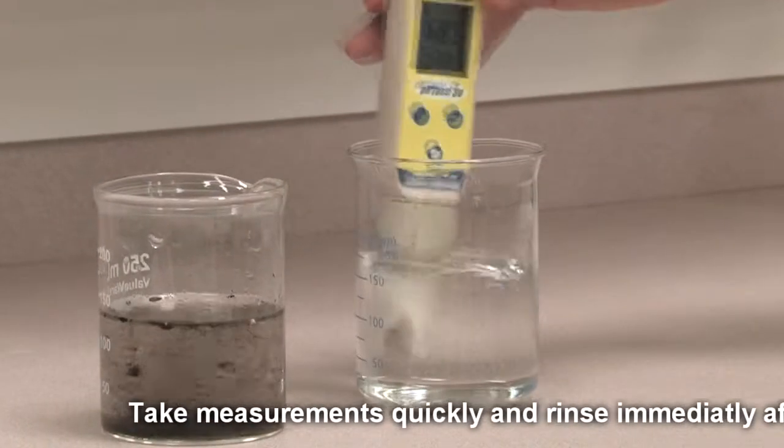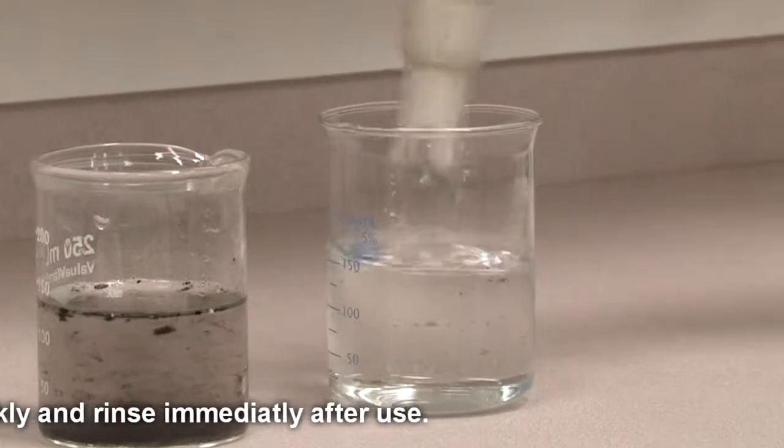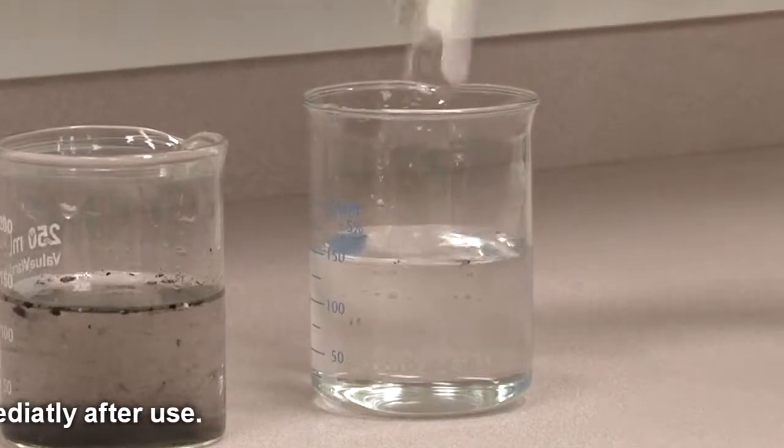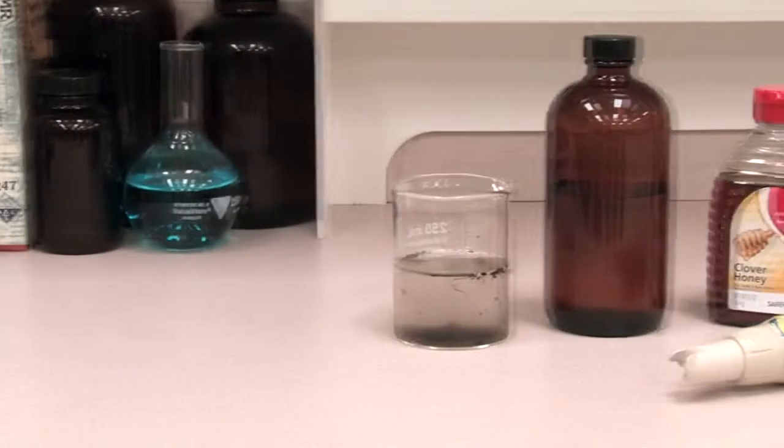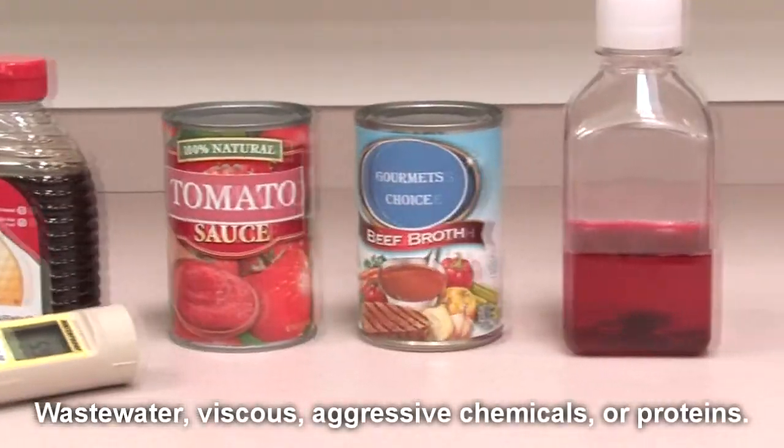When taking measurements in aggressive chemicals, dirty or viscous samples, and heavy metal or high protein solutions, take readings quickly and rinse electrodes immediately after. If performance drops after using these types of solutions, try cleaning and reconditioning the electrode as follows.